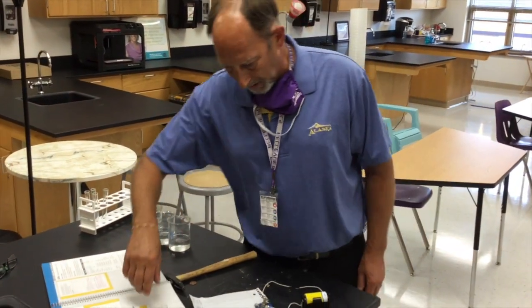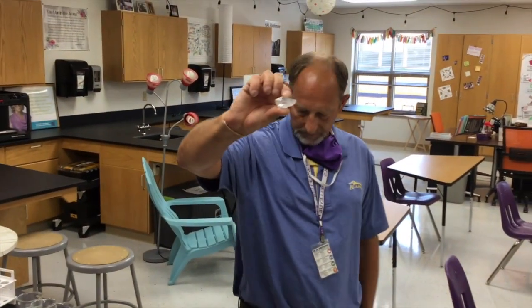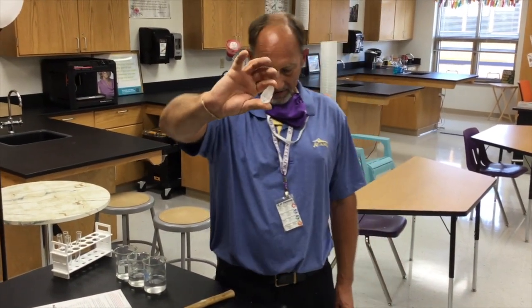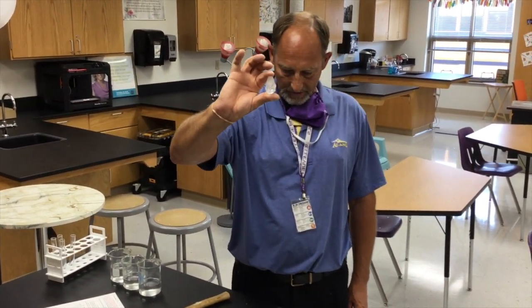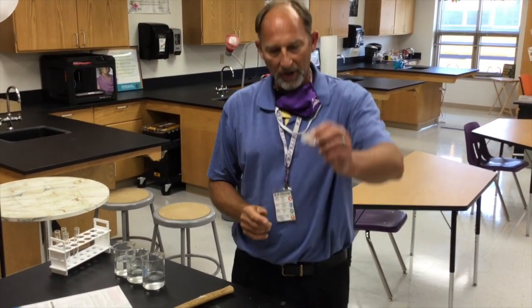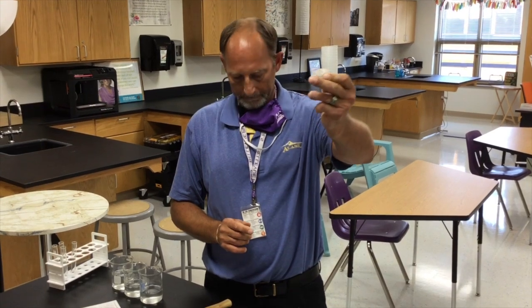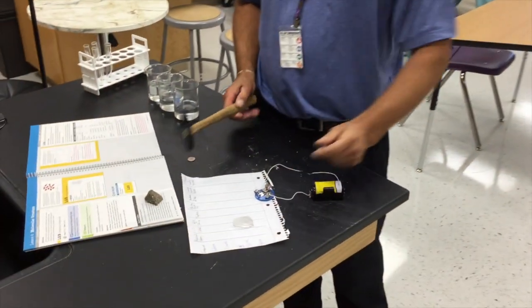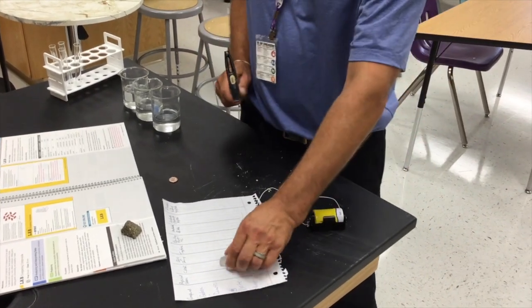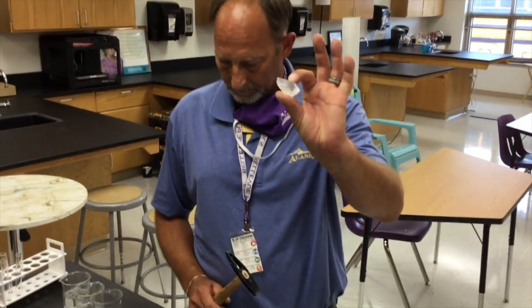We can go with a second compound, quartz. Okay, physical state, color, pretty obvious to you guys. I think shiny or dull, pretty obvious. Texture, pretty obvious. We'll look up the boiling point a little bit later. Pretty sure you all realize if I take the hammer, what I could do to this specimen, I don't want to do it to it, quite brittle.